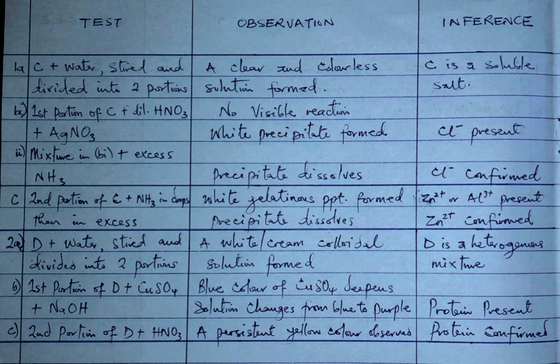So the deepness of the purple depends on the amount of protein in the sample. All right. Then in alkaline solution, that's if you add an alkali like sodium hydroxide, a base, to the Biuret reagent, the copper(II) will form a complex. That's a peptide-copper complex. It forms a complex with the peptide bonds. So the peptide will bond with the copper and form a complex. Once this complex is formed, the solution will turn from the blue color of copper(II) to a purple color.